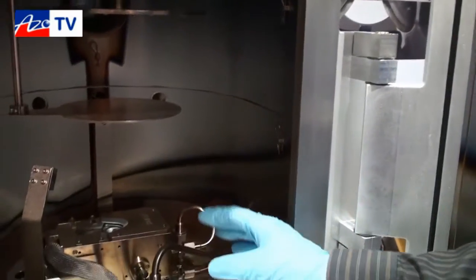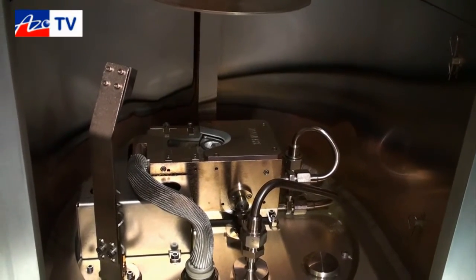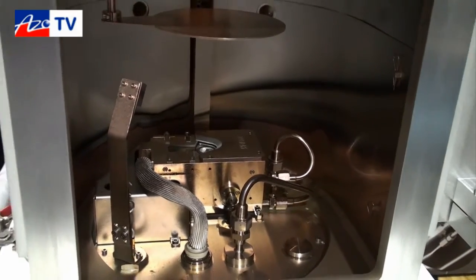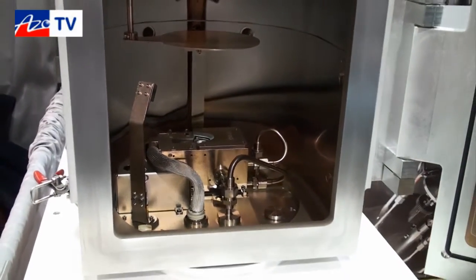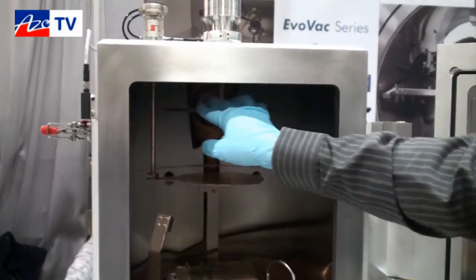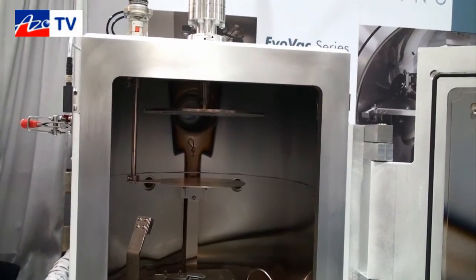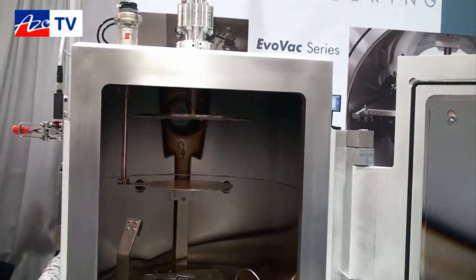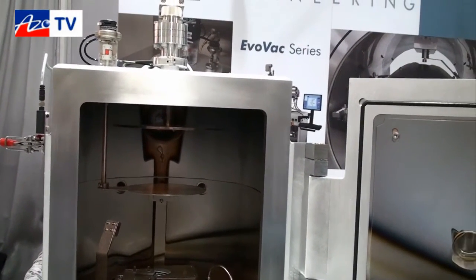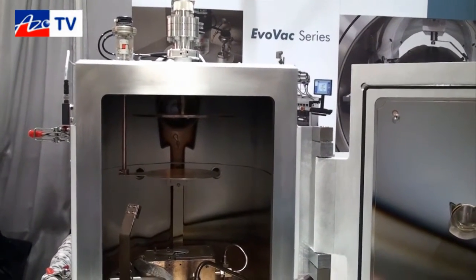This system includes a single electron beam source with multiple pockets. The tool can be configured for electron beam evaporation, resistive evaporation, or sputter deposition — both RF and DC. The sample stage on the tool we brought here today has a rotating platen. We can configure that with heating, cooling, or liquid nitrogen cooling. We can also have it tilt, accommodate multiple samples, domes, or even planetary motion. There's a lot of flexibility — it can be custom designed for the user's specifications.